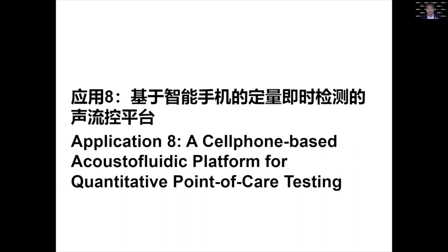So you can take a biosample and do a detection of this biosample. You can have apps on your smartphone to process the data. And then you can send the data by email back to the doctors, to the hospital. And the doctors can send back to your smartphone the interpretation of the data. But one thing a smartphone cannot do is process fluid. However, that's something that our acoustofluidic device can do. So that's why it makes sense.